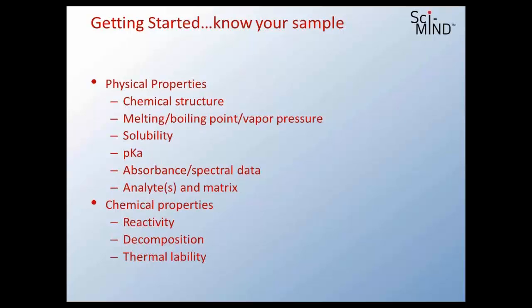I'd like to know solubility of the analytes. I'd like to know what's it soluble in. That's certainly going to help me in sample preparation, or if I have to do HPLC, I certainly need to know that it's soluble in the mobile phase.